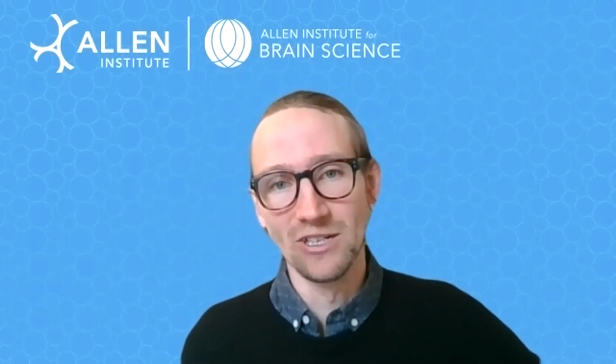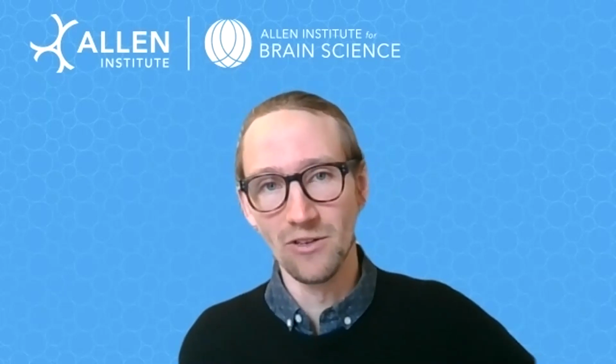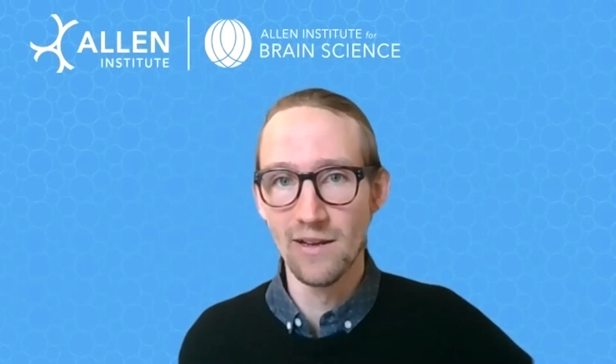Yeah. So just a brief response. I had a few detailed questions that I answered, like about the electrical protocol. And I did want to mention that for people who are experimentalists and more interested in those aspects, look at our community forums, but also if you're really interested in patch-seq, we just released a preprint of a detailed protocol on the patch-seq process that I'll drop into the chat too.